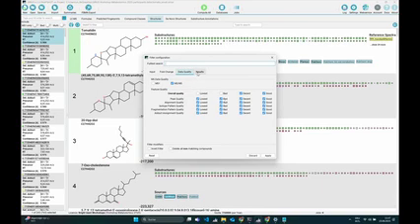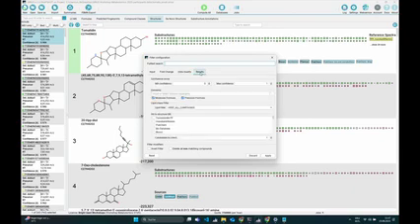But more interesting, you can now filter by results. If we go to this last tab, you can, for example, filter by confidence. If you only want to show features above a certain confidence, one of the thresholds you might want to use is everything higher than 0.6, which is at least a good hint that this is a good feature where you get good structure hits. But you can select whatever you want here. You can also filter by molecular formulas.